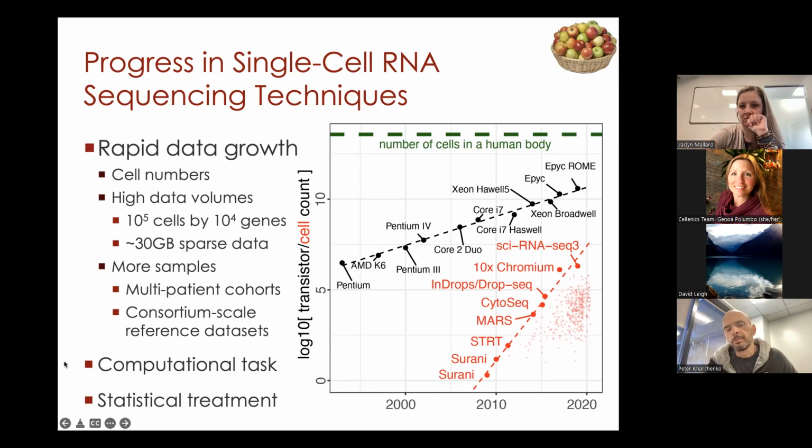All that brings up computational tasks as well as some statistical questions. And so the platform, I think, is meant to wrap around some of these computational issues to give a more user-friendly interface to analysis, or at least some of the standardized analysis.